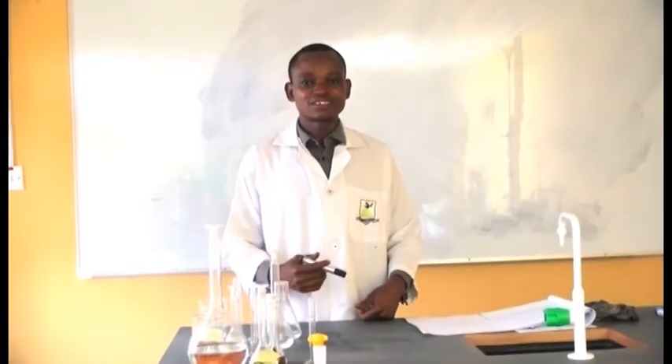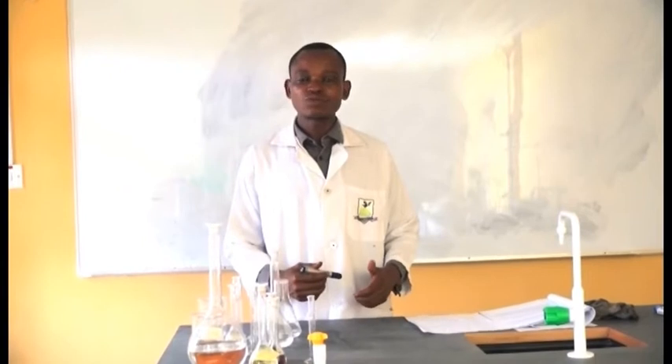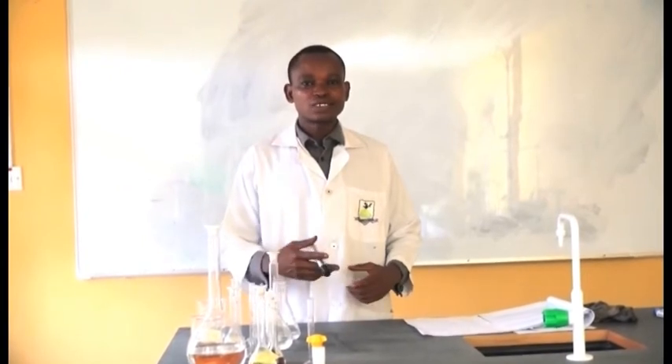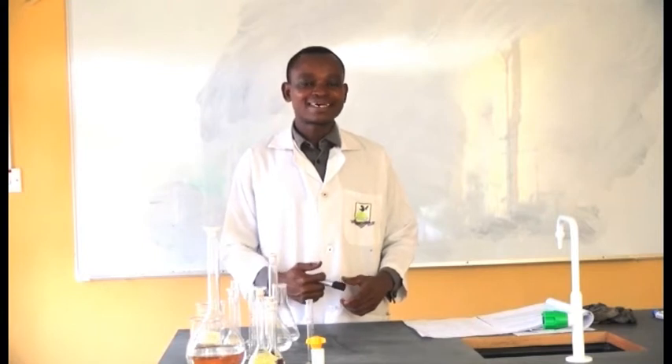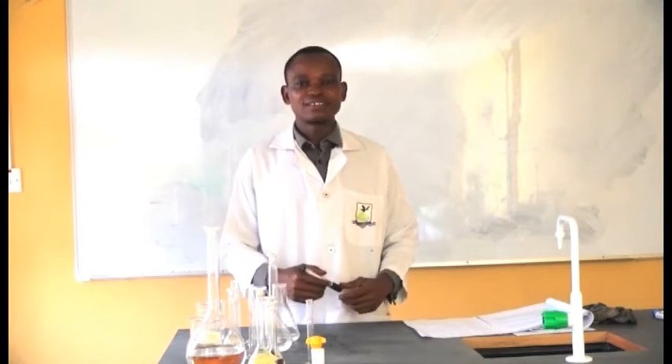We can use this iodine value to determine the degree of unsaturation in the fat sample. The higher your iodine value, the higher the degree of unsaturation. That's what we want to look at in this session.